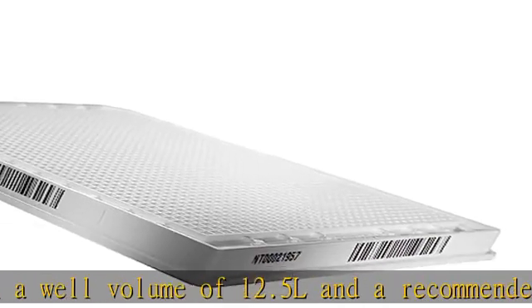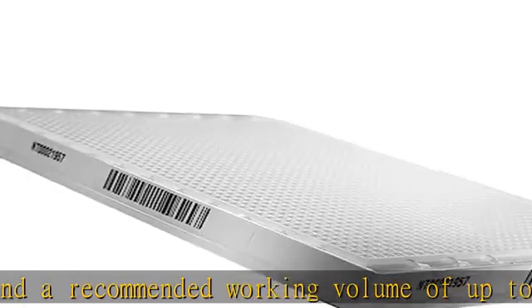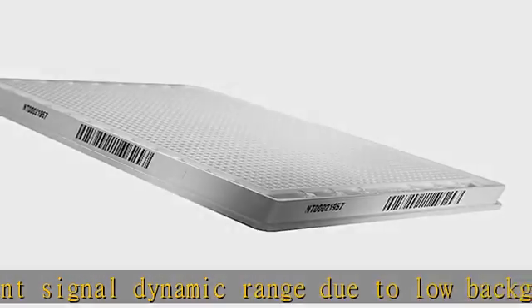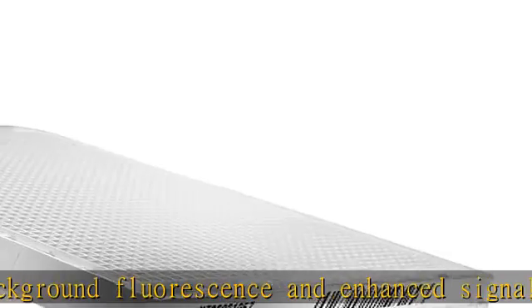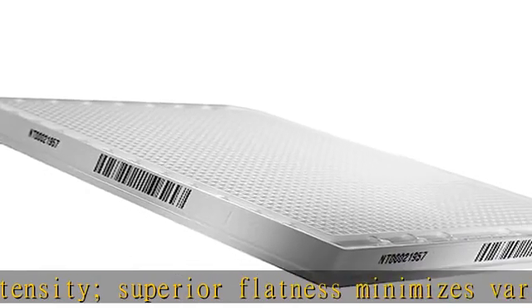Superior flatness minimizes variability within a plate and between plates. Not treated, or medium binding. The polystyrene surface is hydrophobic in nature and binds biomolecules through passive interactions, suitable primarily for the immobilization of large molecules such as antibodies that have large hydrophobic regions that can interact with the surface. Binding capacity of approximately 100–200 ng IgG/cm².